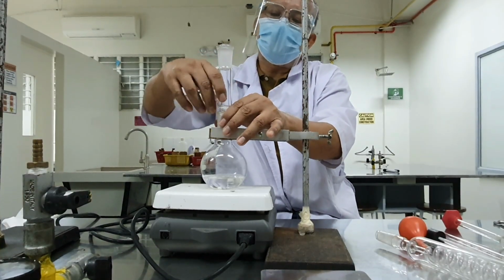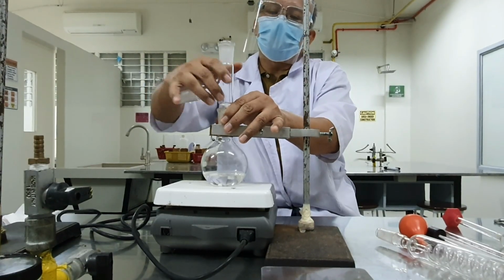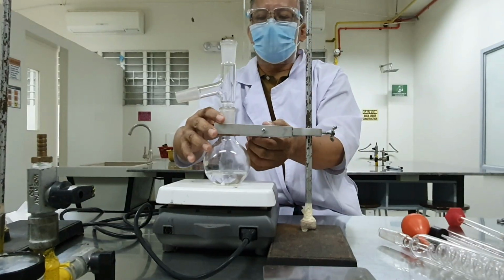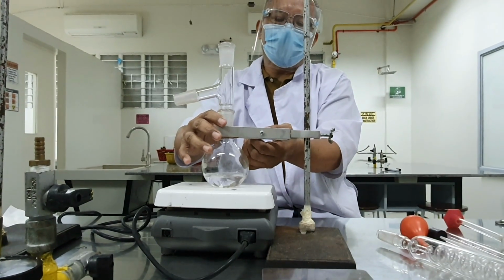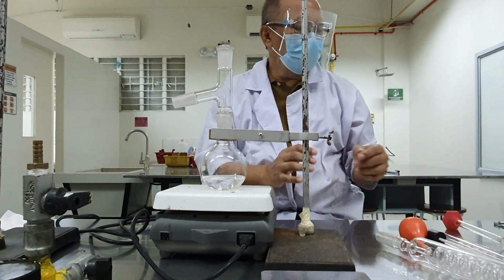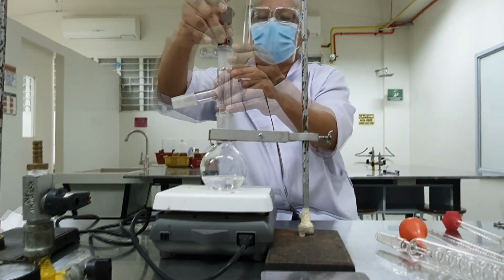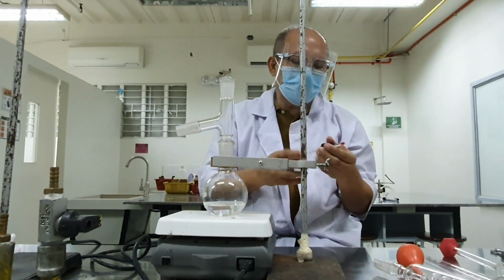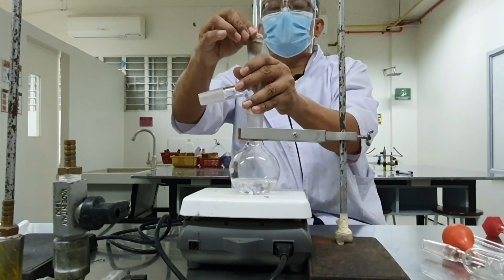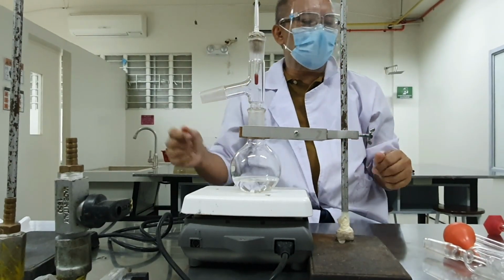So you can turn this one, not to spread the silicone. This is to avoid the sticking of the tubing ends. Okay, so that is okay now, and then we are going to put our thermometer. Our thermometer is quite far. So we have this one clamp. Connect. You have the thermometer set at the intersection.